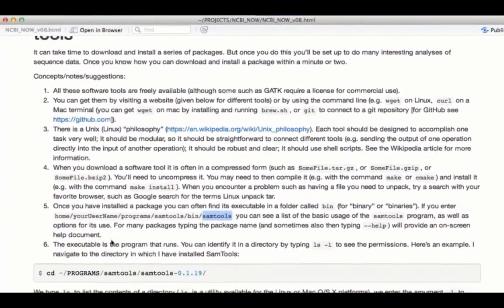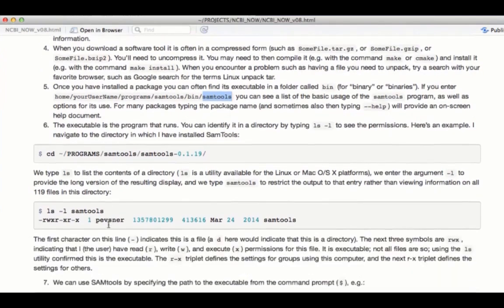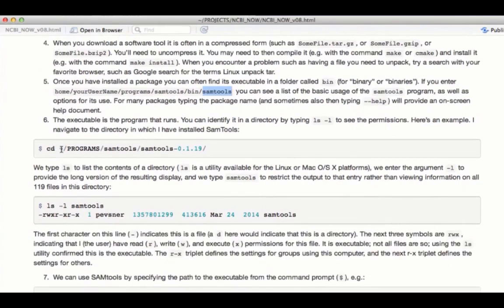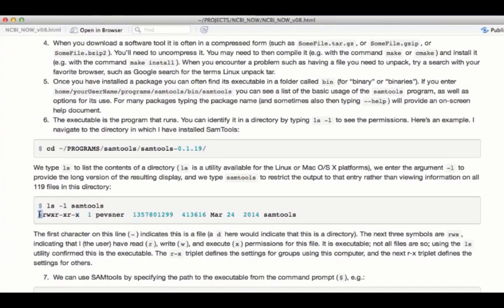So next, the executable is the program that runs. You can identify it in a particular directory by typing ls dash l, that means the long version, to see permissions and to see the nature of the particular files, whether you have, for example, an executable or not. And so here's an example that I've highlighted. You can go cd or change directory to your programs SAM tools and go into a SAM tools directory. And there you can type ls to see the contents or ls dash l for the long version. And you can see that this is an x because it's an executable. You can also see the size of the file information, such as the date that it was obtained. The first character on this line indicates that this is a file that's the dash. This would be a d if this were a directory. The next three symbols are rwx for read, write, and execute. And this applies to the user, the group, and other.